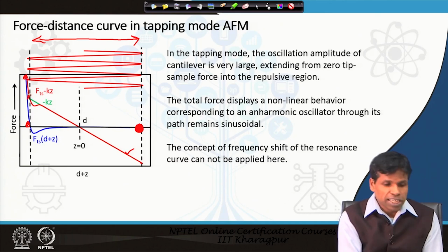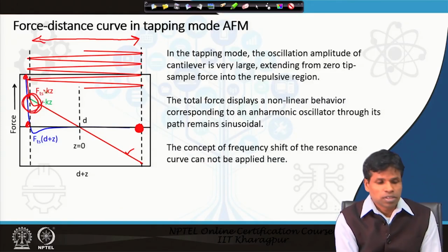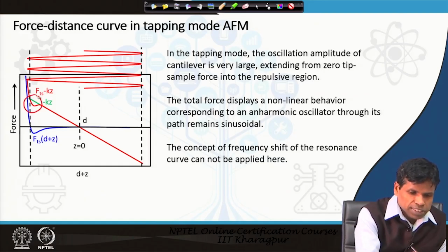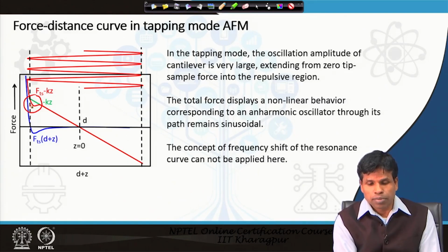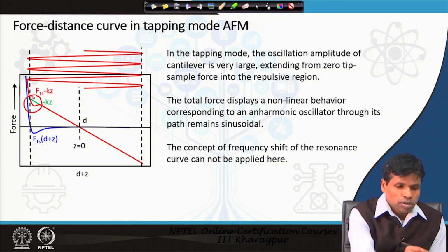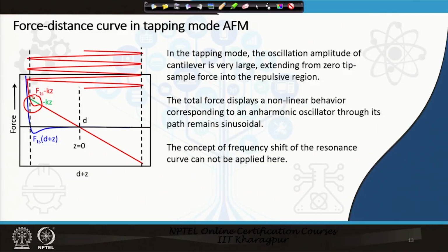It does not follow the linear relationship in this region. In this region particularly, this red curve you see does not become linear, because of giving an anharmonic oscillator type of behavior, but the oscillation remains sinusoidal. The oscillation remains sinusoidal, but it does not follow the linear behavior of the force distance curve. Thus, the frequency shift concept cannot be utilized in this case.